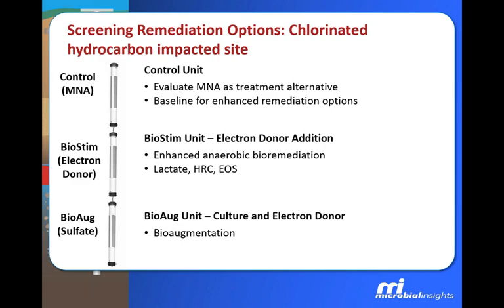It is possible for us to take the biotrap in one of these in situ microcosms and preload it with that bio-augmentation culture, in addition to an electron donor. So with this, we can determine that will that bio-augmentation culture, number one, survive in that environment, and number two, will we see an effect on both the microbiology and the chemistry when these units are supplied.